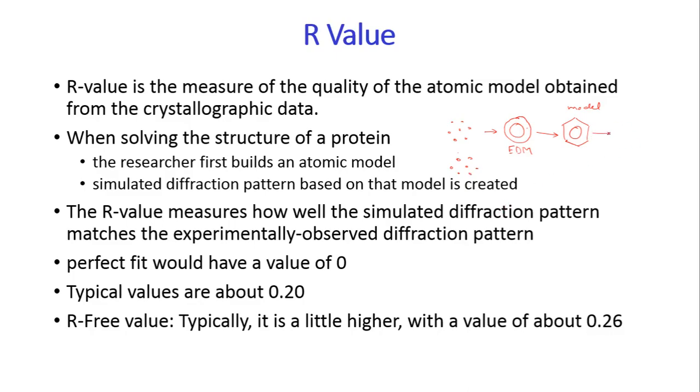If I give this structure to any X-ray crystallography machine, what diffraction pattern might I get? This diffraction pattern is compared to the experimental diffraction pattern, and this is called the predicted diffraction pattern.